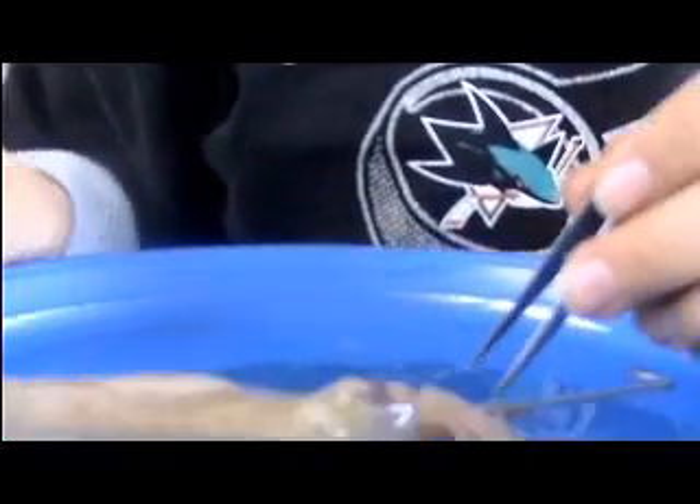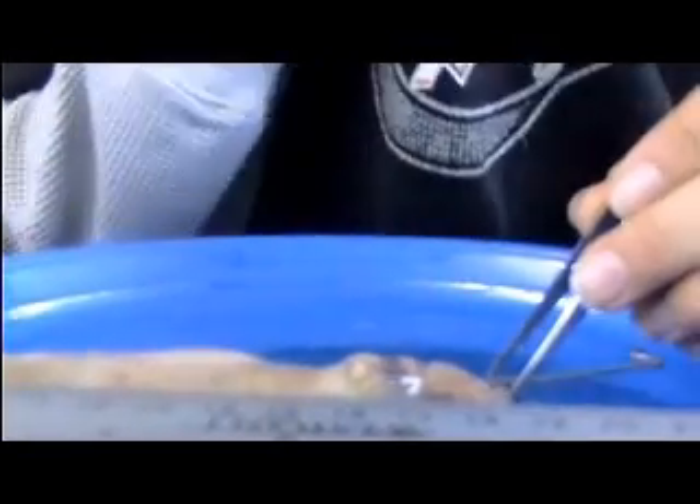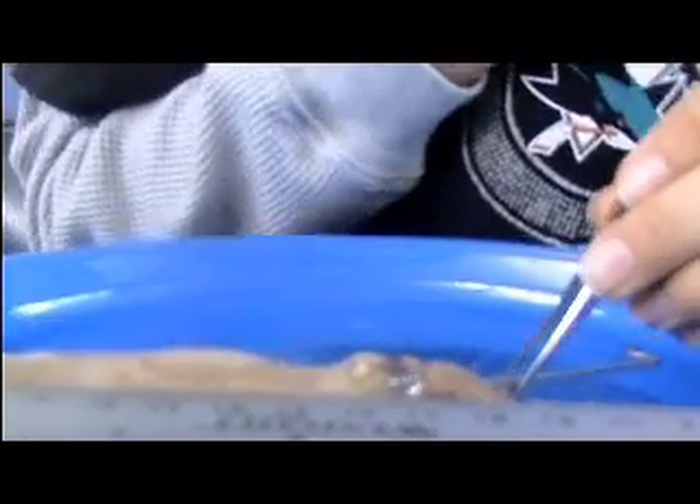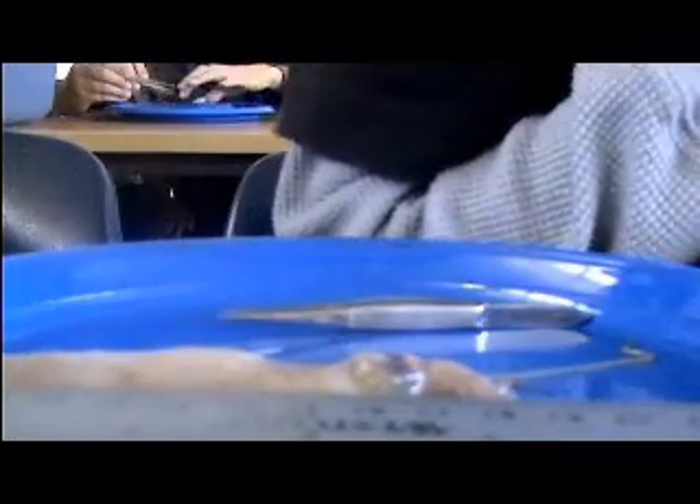Draw your feet. It looks like the camera is a little shaky. All right.